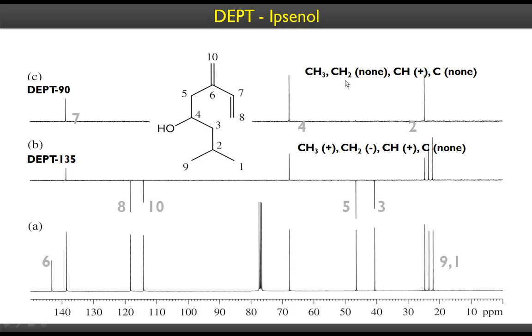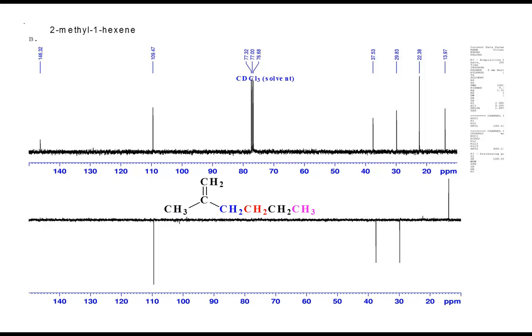It doesn't show CH3 and CH2. DEPT 45 is the one which has all three positive peaks. That means methines, methyls, and methylenes give a positive peak. Excuse me for that confusion. Sometimes confusion helps us clarify some things, so it's not bad confusion, right?